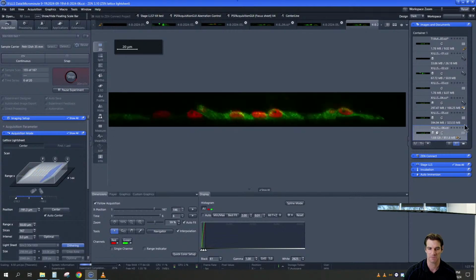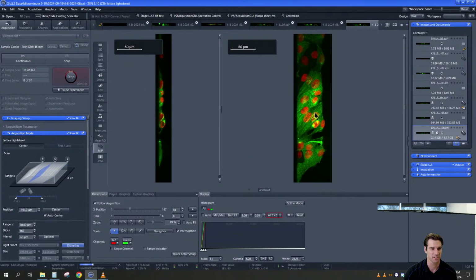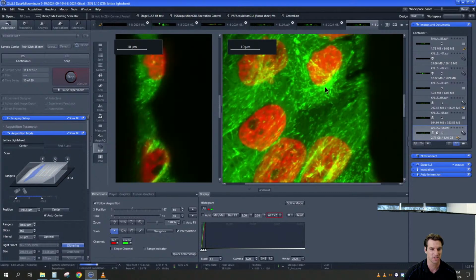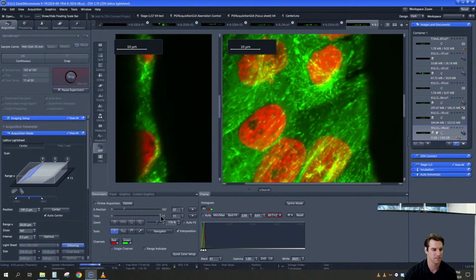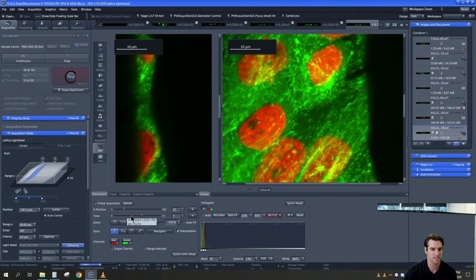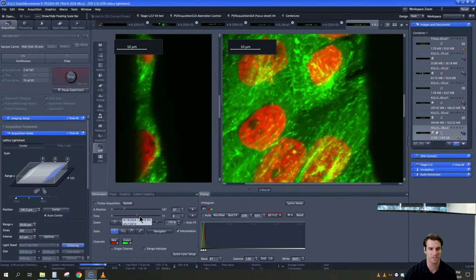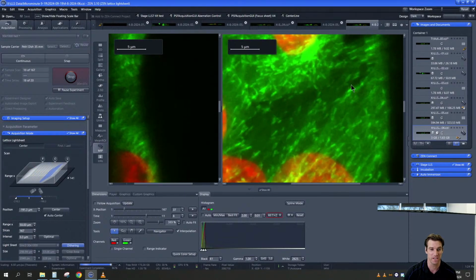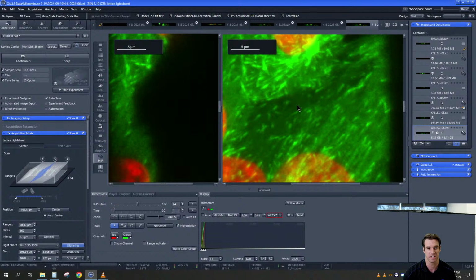And so if we look at the maximum intensity projection of this, then we can actually watch each time point as it comes through. And so you'll actually be able to see these end-binding protein fluorophores shooting through there in the cells. Isn't that great? I love watching these. And I should point out also that end-binding protein has a lot of unbound protein as well. So this background in here is real. That is actual fluorescence.